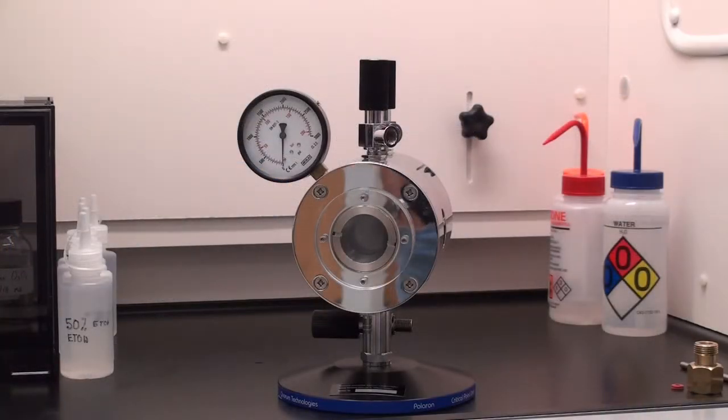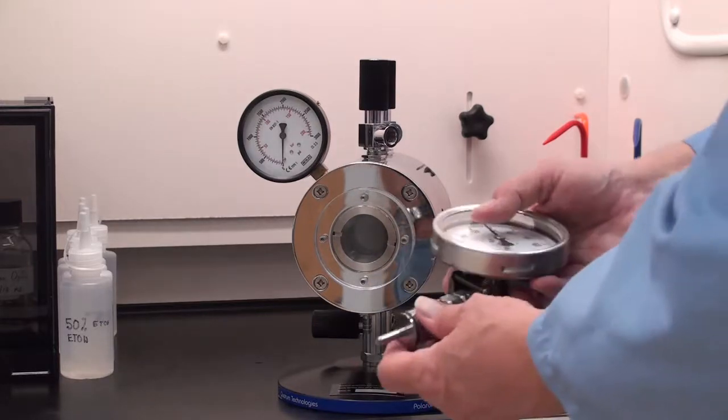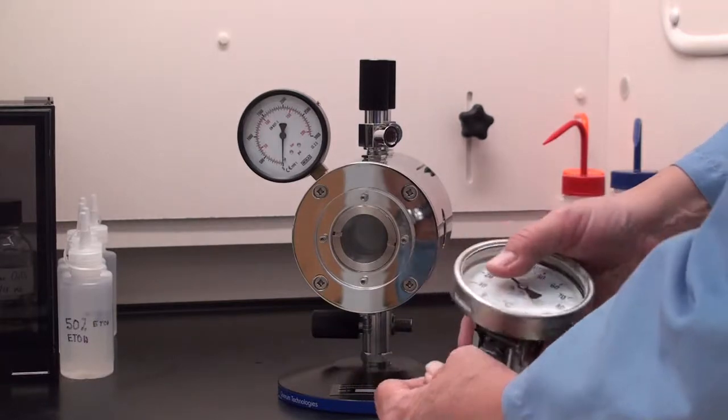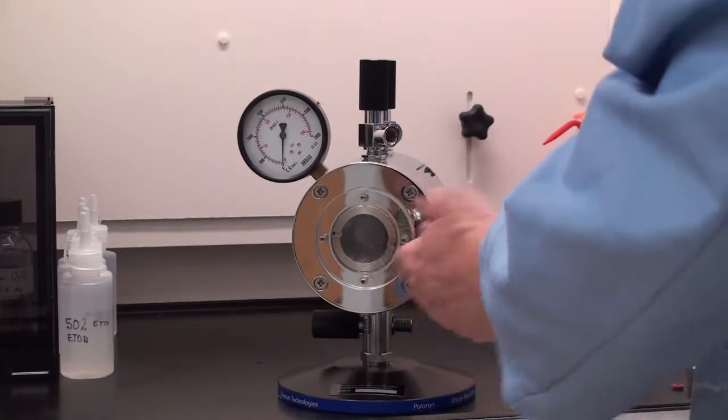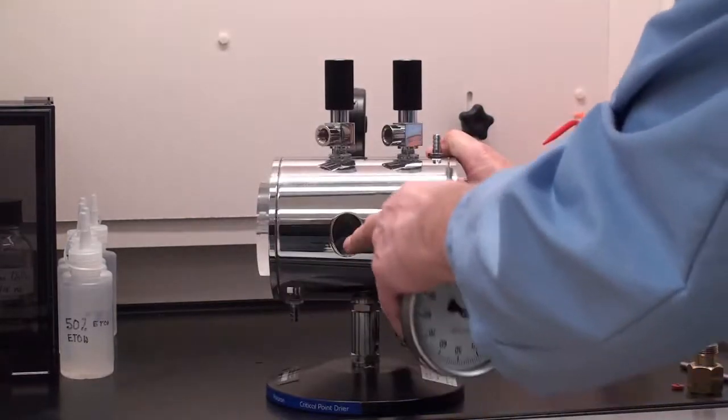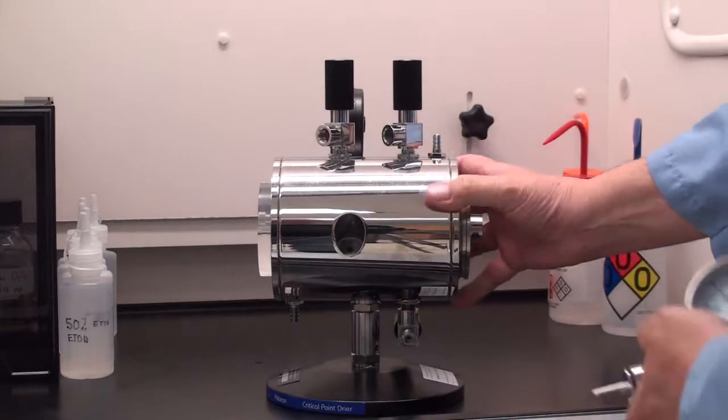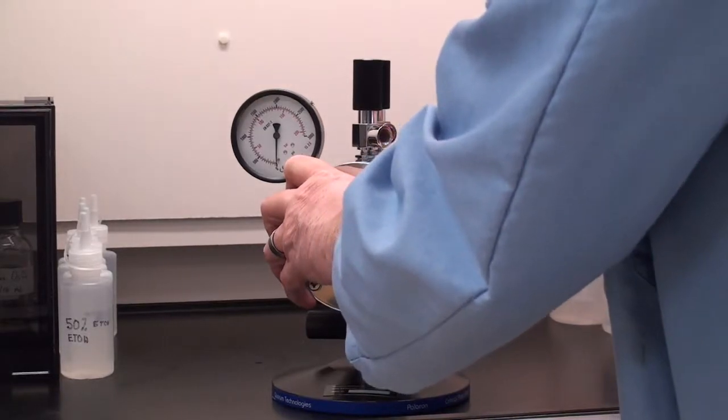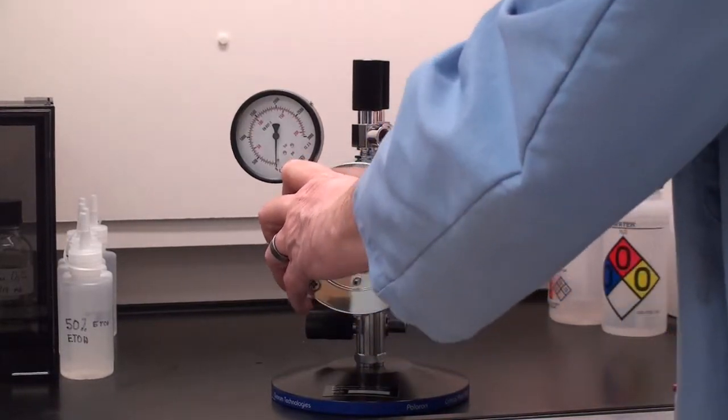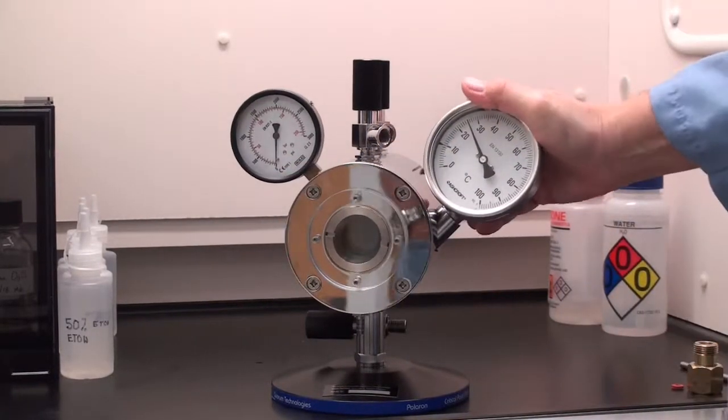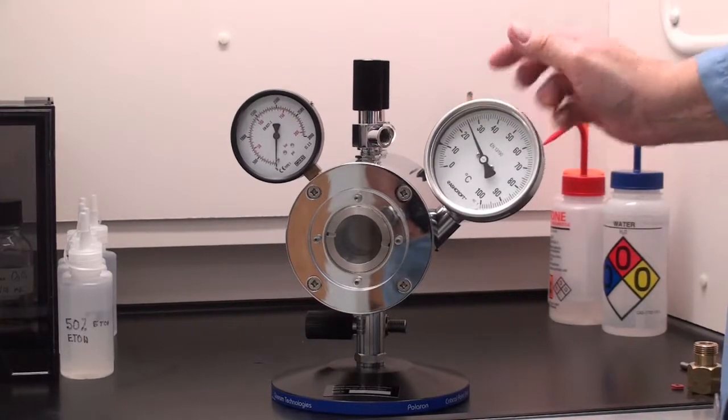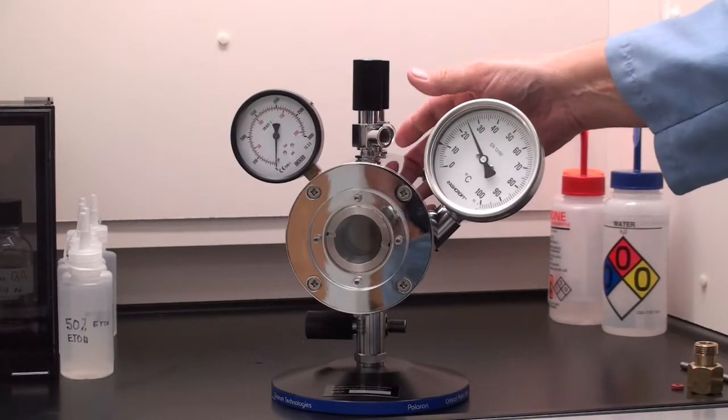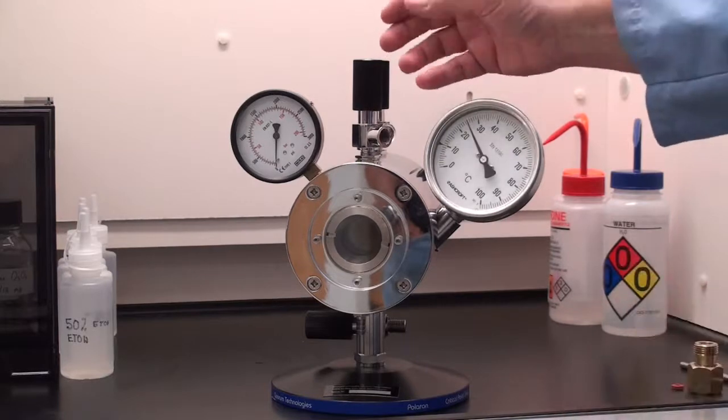All right, here we are at the E-3100. It's in a fume hood currently. I have the thermometer which we just saw on the setup, and that inserts into this orifice here and gets pushed all the way in as far as it will go. And then this can remain right in front where you can monitor it.